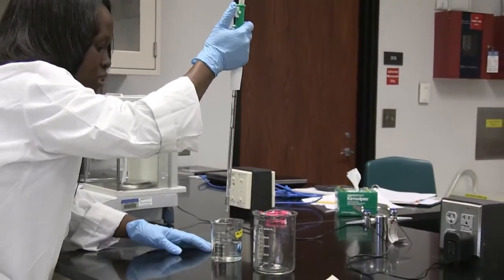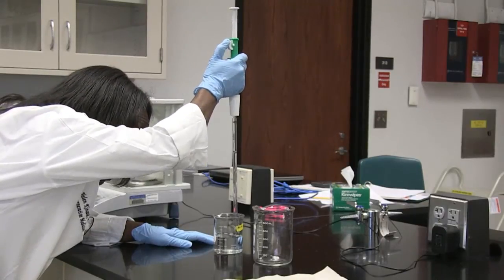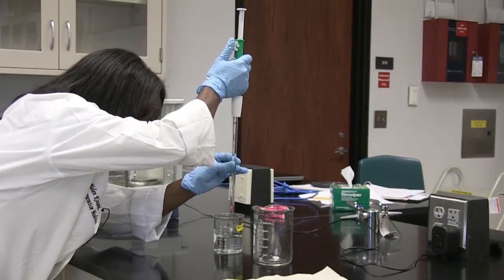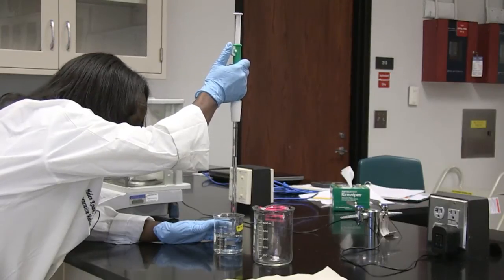A bubble got in, so I want to make sure that I get rid of the bubble. I'm below the 10 mil mark, so I'm going to add a little bit more to get me there. Now I'm at the 10 mil mark.